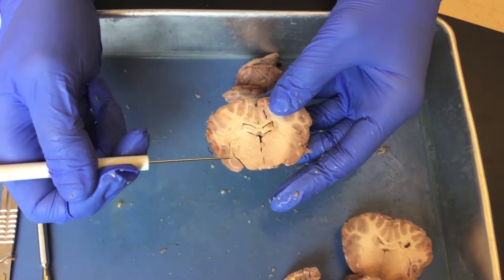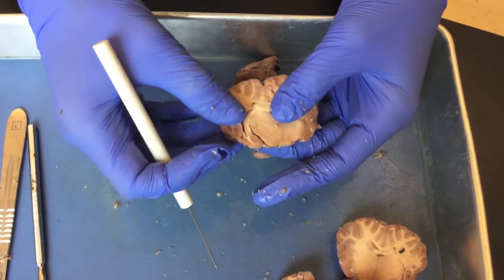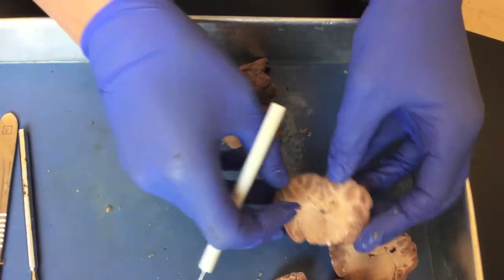If you wish to do a further dissection, trying to dissect out the hippocampus, you can do that on a separate sheep brain. It's a complicated structure that spans many sections.